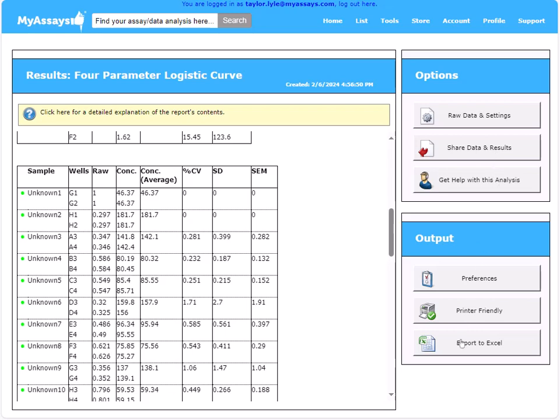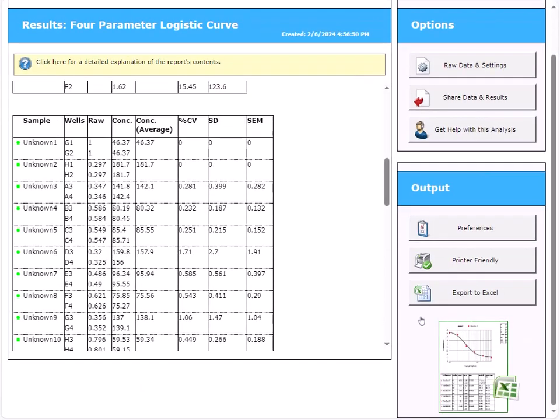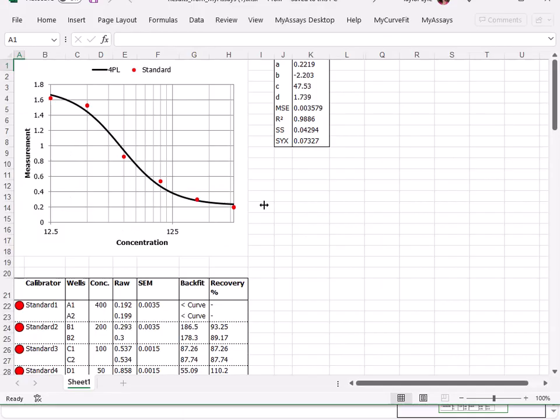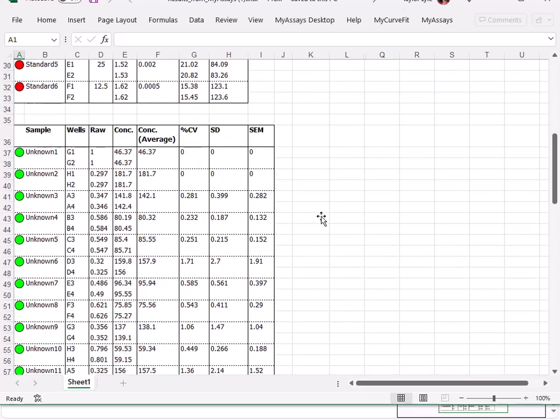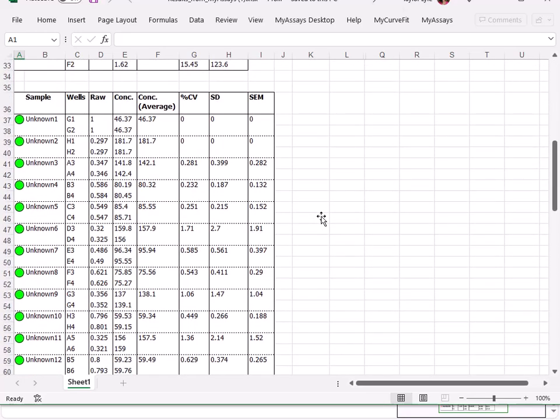Opening these results in Excel, you can see the report is neatly organized, includes the curve fit information, and full transparency in the sample table, following the sample locations, raw results, and calculated concentrations through the analysis.